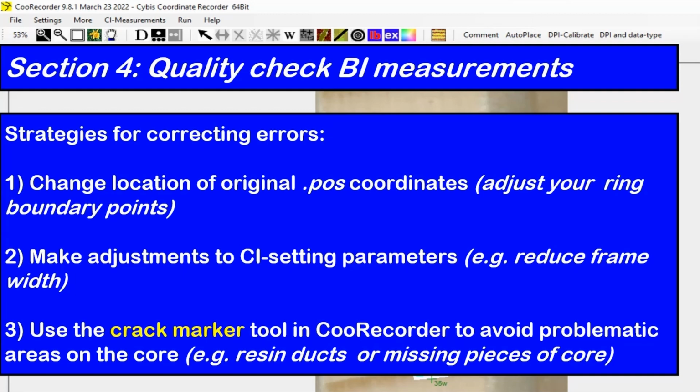This is very important because changes in data collection frame features are applied to all of the rings, the one you want to correct, and all others. Thus, some unintended changes could appear in parts of the core that were previously considered to be okay.